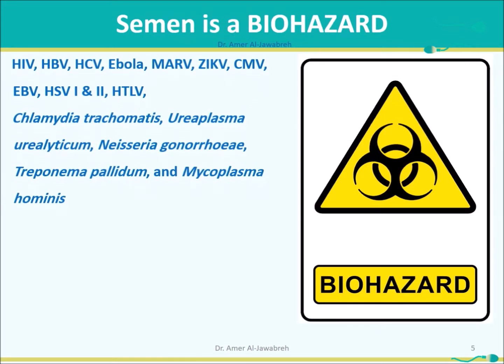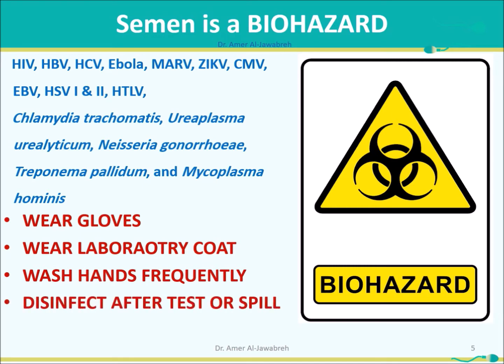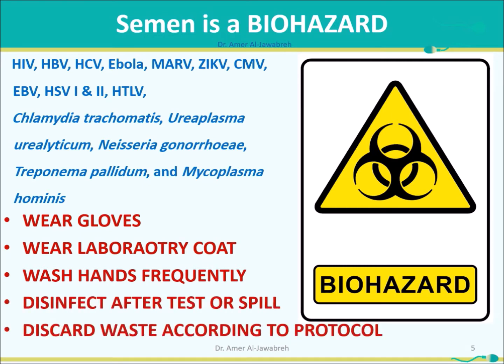Semen is a biohazard. It contains many pathogens such as viruses and bacteria listed here. Therefore, wear gloves and a laboratory coat. Wash hands. Disinfect after a test or a spill. Discard waste according to protocol.